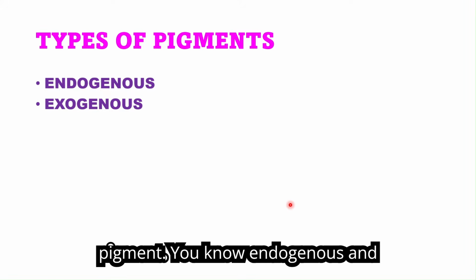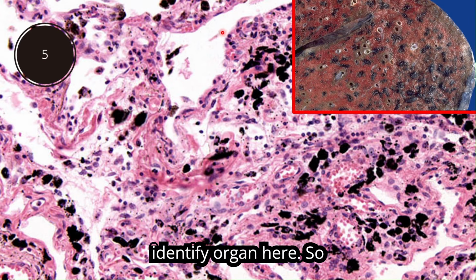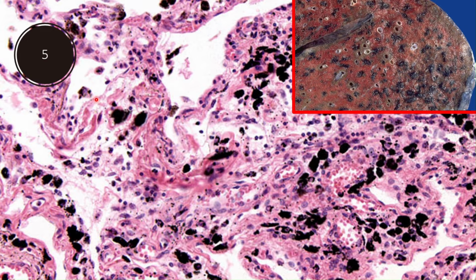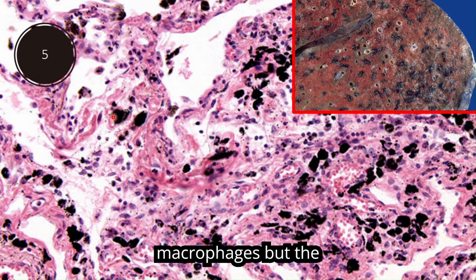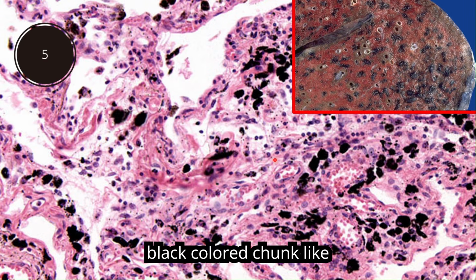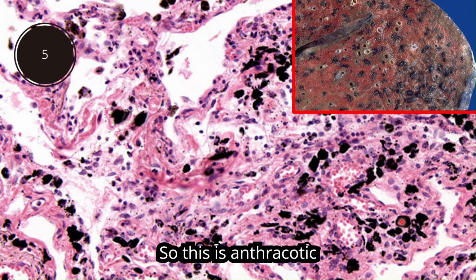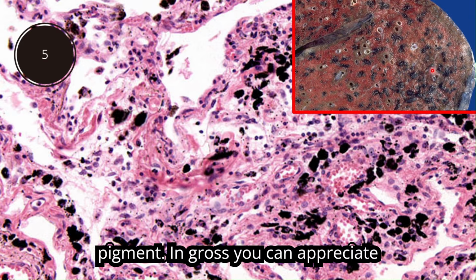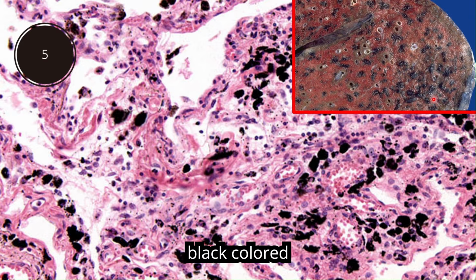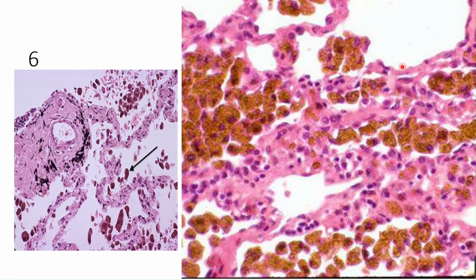Now types of pigment. You know endogenous and exogenous pigment. So identify the organ here. So this is the lung showing alveoli and macrophages, but the important thing to see is the black colored chunk-like deposition in the parenchyma of lung. So this is anthracotic pigment. In gross you can appreciate black colored deposition of pigment in the lung.